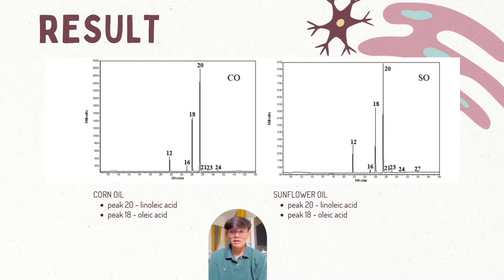The next one is sunflower oil. This chromatogram shows sunflower oil.